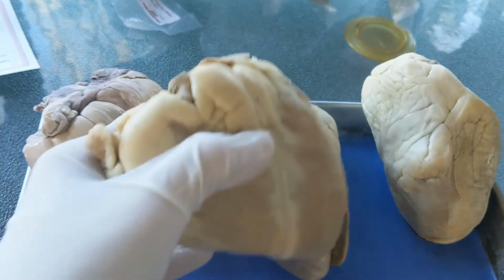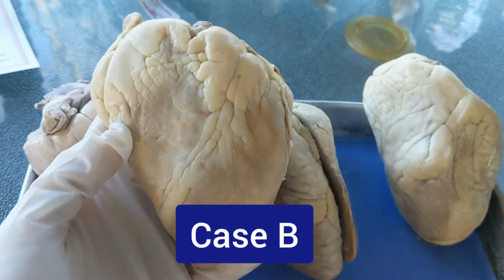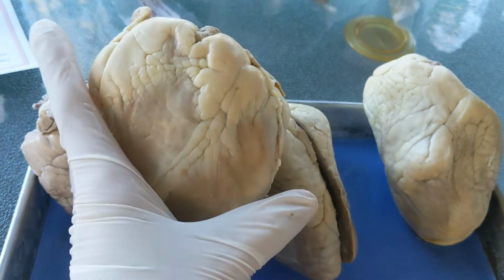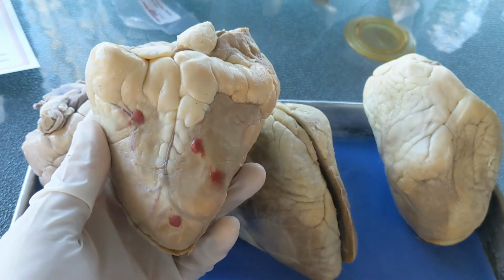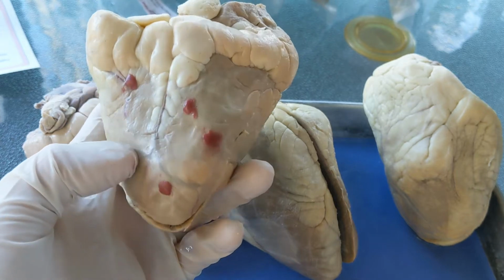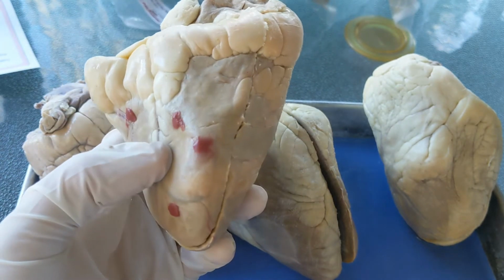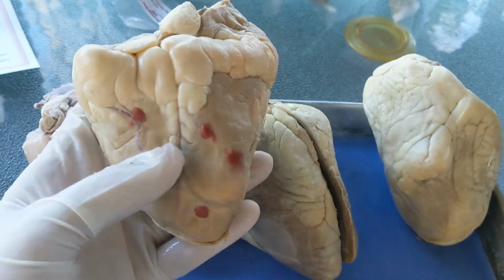Here is patient B. And again, we're going to start with the external. I like to look at the front of the heart first so I can see the coronary artery crisscrossing. That's how I know it's the front. And then I'm going to flip it. Ooh, dang. Yeah, that's not good. So you want to look at the coronary arteries, see if you notice anything. I totally gave that one away. Sorry about that. But that is pretty obvious and not looking so good.